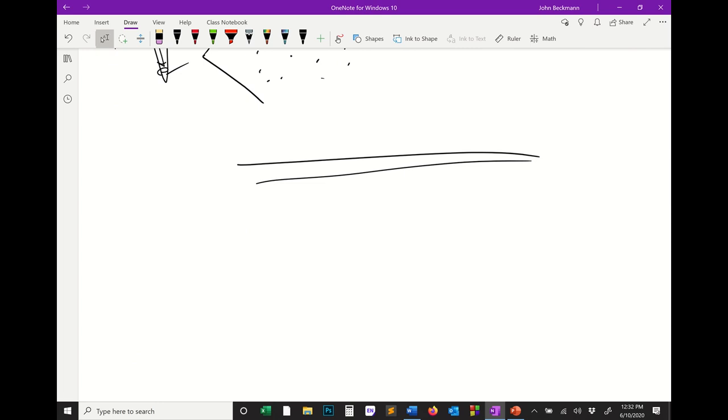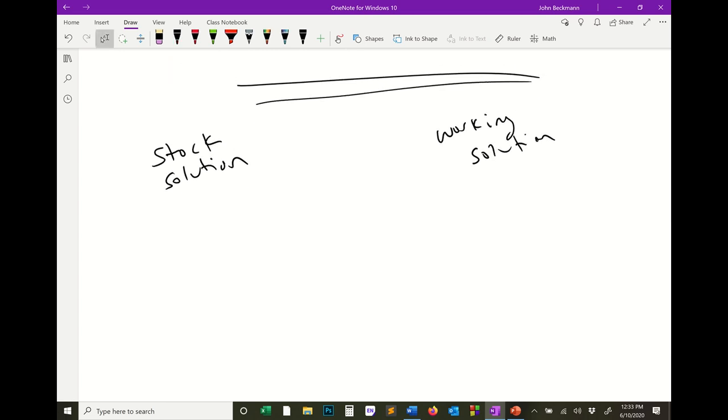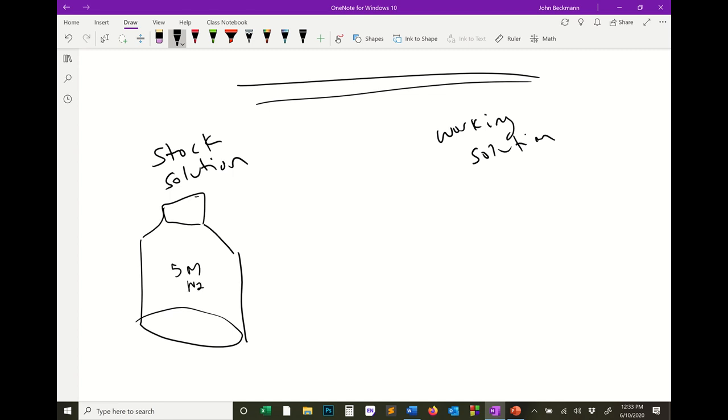There's a hierarchy of solutions. There's what's called a stock solution, and there's what's called a working solution. So in the lab, like I said, there's these different tools. Let's say you set up what I'm gonna describe here as a stock solution of 5 molar sodium chloride.